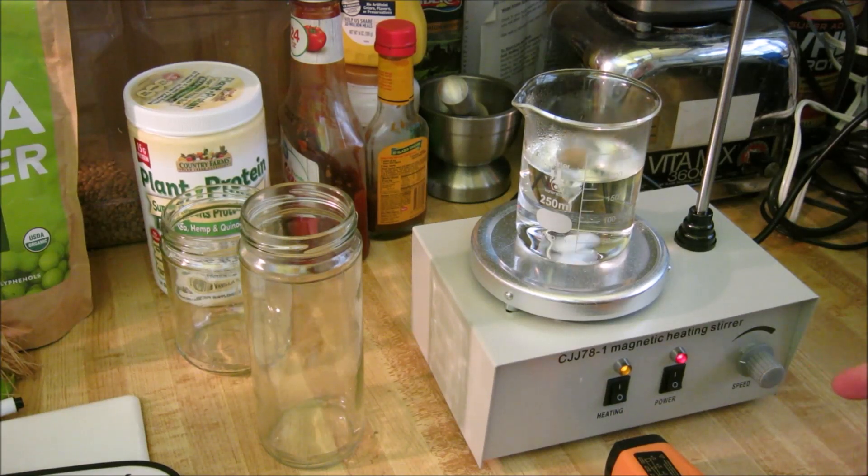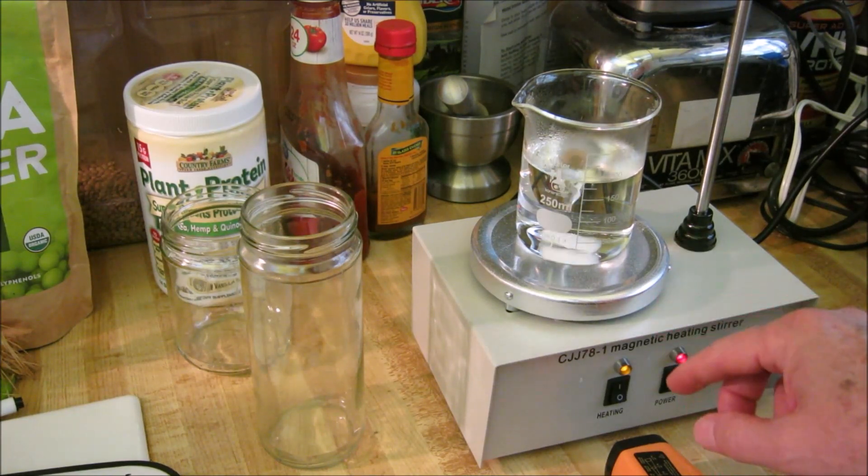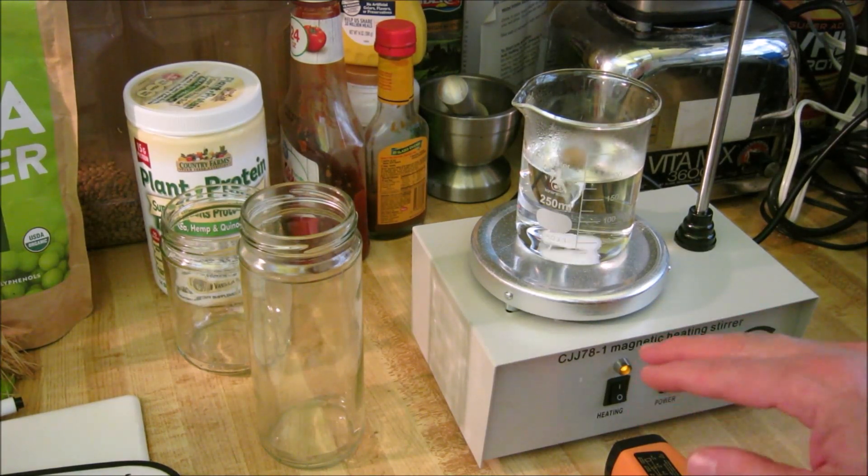It's actually a pretty good instrument. The only negative is it doesn't have a thermostat for the heat, so you can't control the temperature.